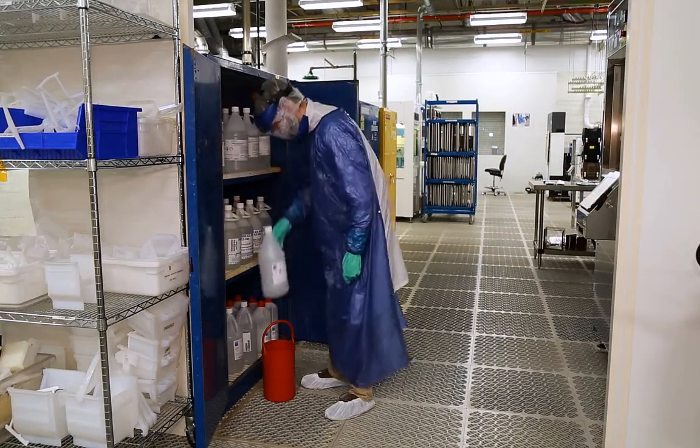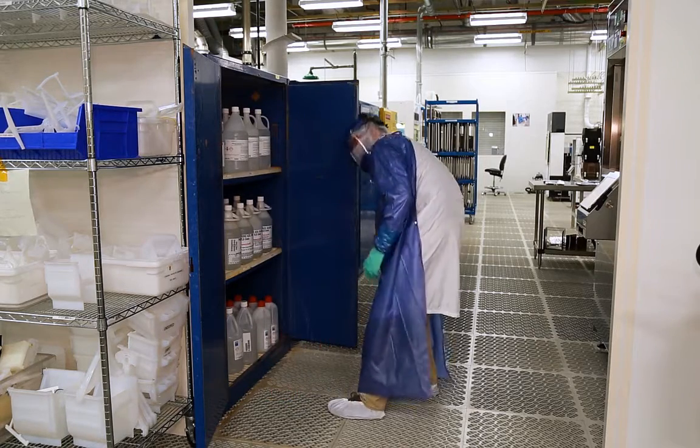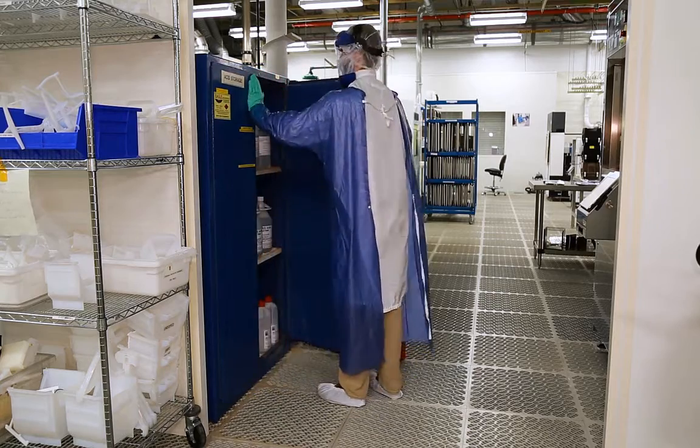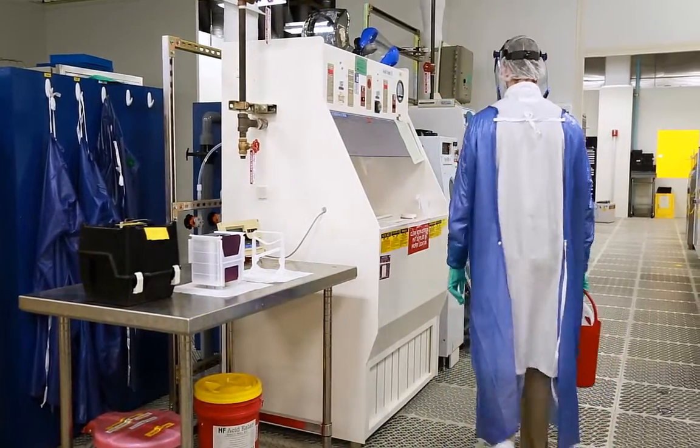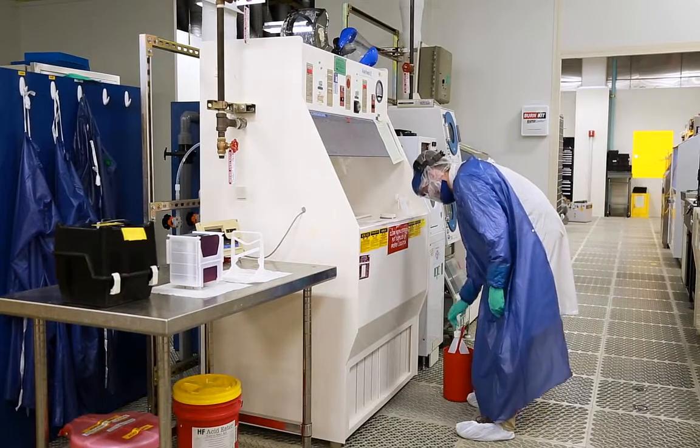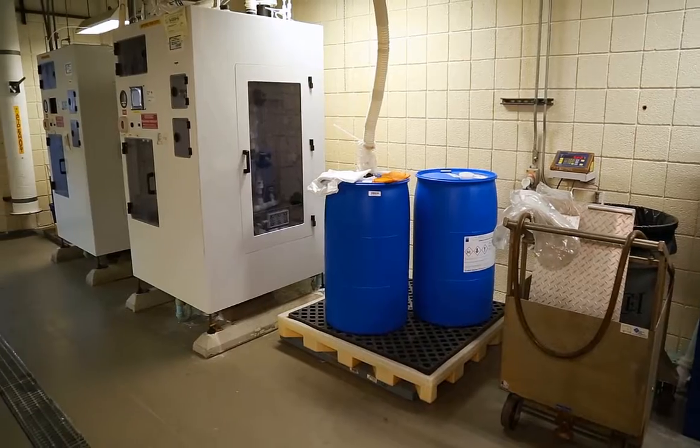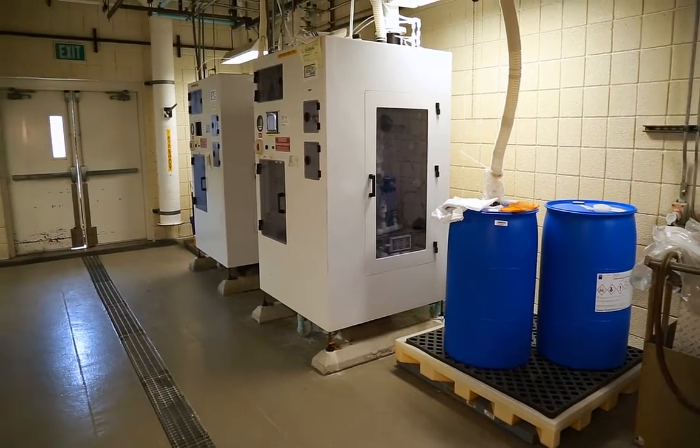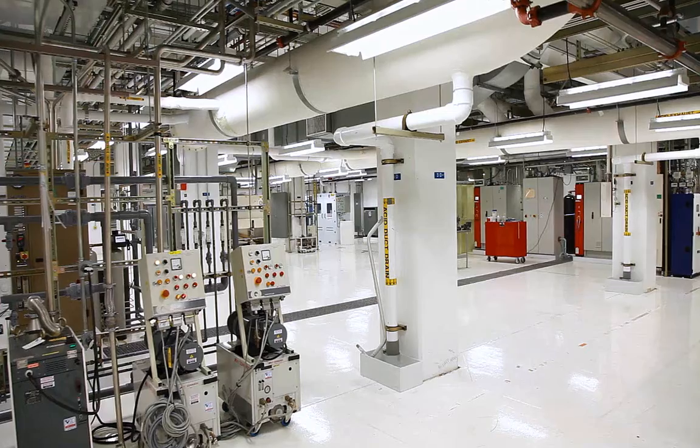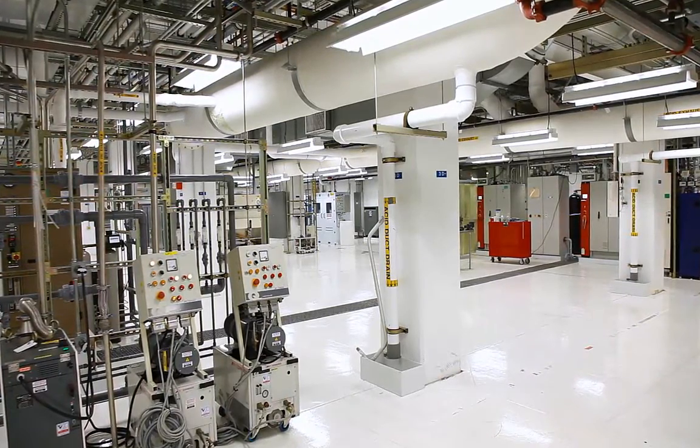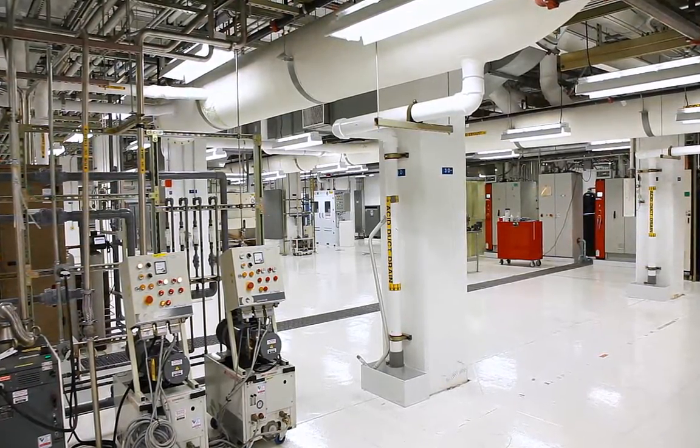Use an approved secondary transport container when transporting HF or any other corrosive acid within your immediate work area. Make sure your walkway is clear and free of obstructions, and alert other lab users to your actions. Carefully remove the container at your destination. In the clean room areas with visible underfloor plumbing, HF solutions are transported throughout the facility to be used at the wet benches and the fab areas. However, most HF facilities do not offer this service, and manual transportation procedures must be followed.